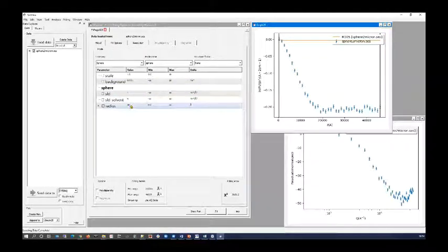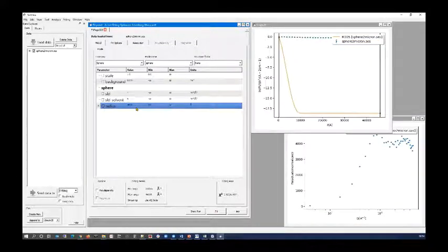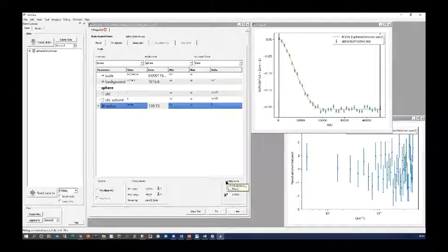So we have a bit of a priori information here because we know these are 2 micron spheres. So 50 angstroms is obviously going to be a bit low. So let's shove that up to something rather larger, shall we? And let's fit a volume fraction and a background and a radius here. And there you go. SasView has actually fitted the SESANS data, because what it does is it takes the model calculation and performs what's called a Hankel transform to go from reciprocal or Q space through to real space or Z space. So it does that on the fly. So we can fit SESANS data.